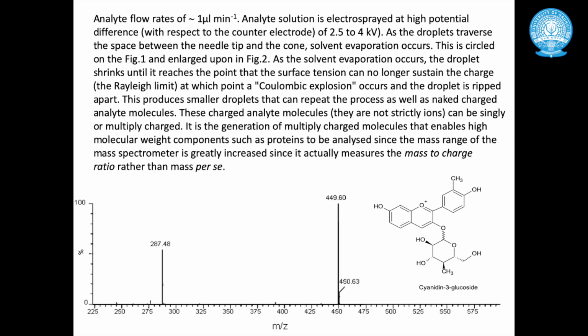Each functional group or each electronic arrangement wherein a hydrogen atom is present will have its signature in the form of a peak.